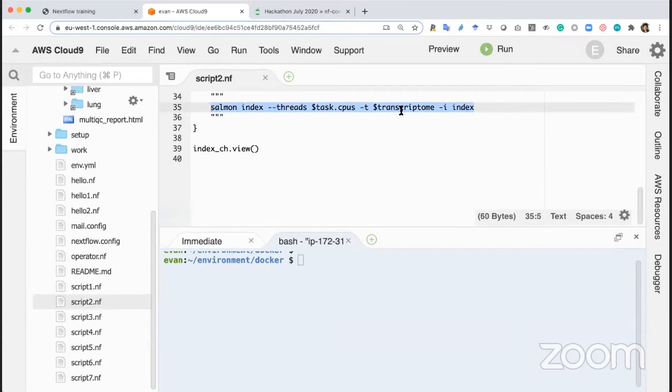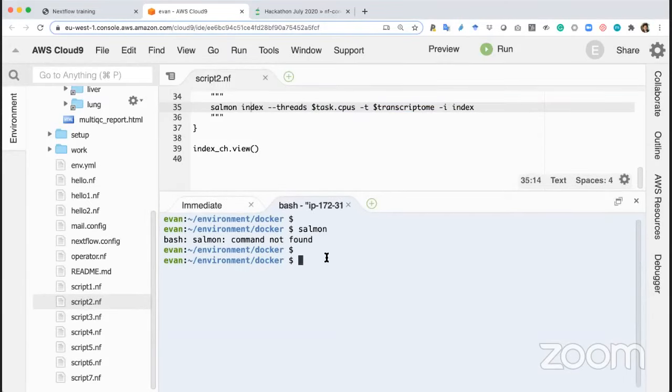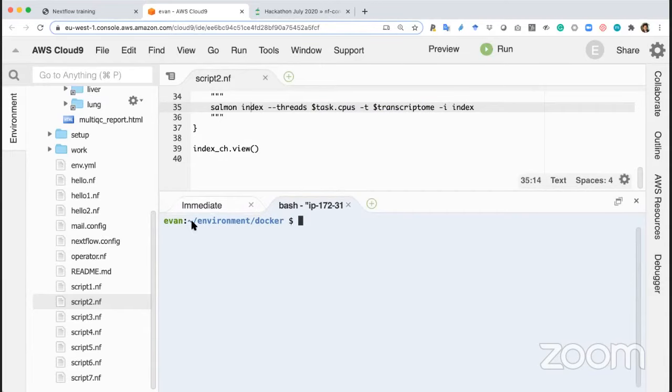We want to index our transcriptome using salmon index, and we want to do this inside the container. The first approach would be to simply consider what we had before. Remember that we can run any command. So we can say docker run my image, and then write salmon, because this is what we want to run. We could actually just copy this command, couldn't we? We could just say salmon index. We know that we have to provide a transcriptome, and we have a transcriptome in this data.